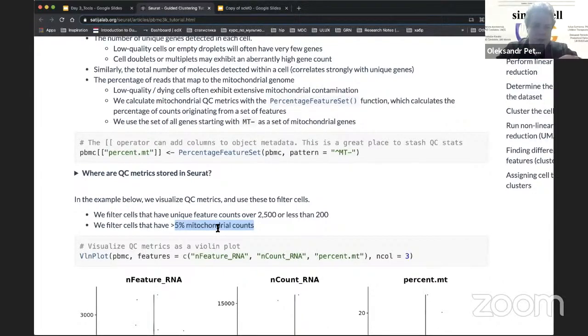And again, which percent usually for organoids or for neuro? Yeah, I remember that I used 25%, but it's quite high. It's quite high, but because some cells in my clustering results were assigned as dead or damaged cells, it was quite tough for me to understand if there were literally some pieces of cells, or some contamination, or if they were just stressed cells.